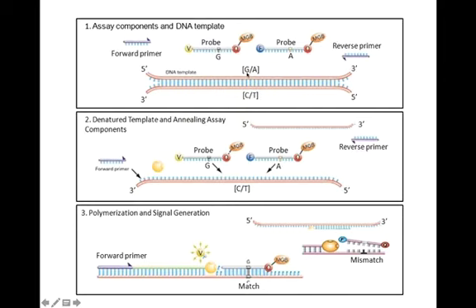The sample has the G nucleotide. And upon the emission of the blue color fluorescence, it will indicate that the sample has the A nucleotide. So this is how the multiplex reaction works. And for example, if the detector detects both color dyes, it shows that the person is heterozygous because on one chromosome is present the G nucleotide, on the other chromosome is present the A nucleotide.